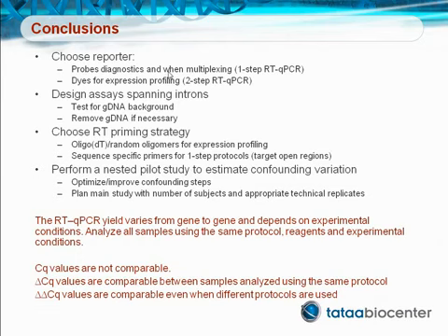Always analyze all samples with the same protocol, reagents, and under the same experimental conditions. Cq values are instrument dependent and not readily comparable. Delta Cq values are comparable between samples that have been analyzed using the same protocol. Delta-delta Cq values are comparable even when different protocols have been used.